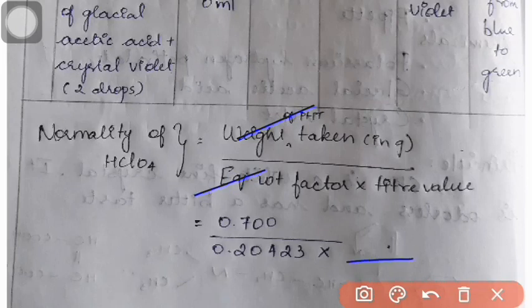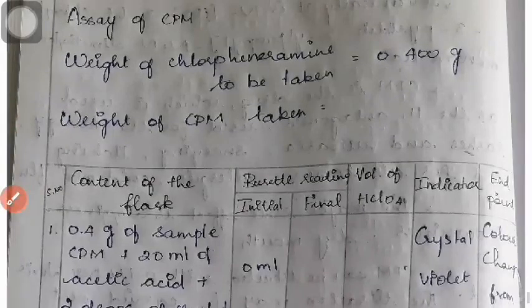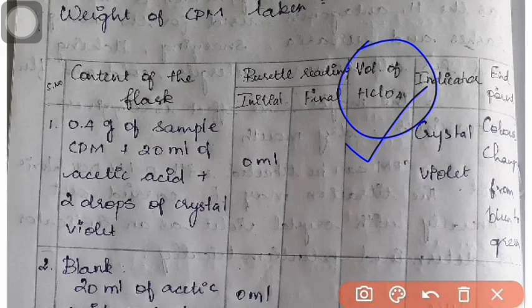That will give you the normality or molarity of the perchloric acid. And for the assay, this table is used. So 0.4 gram of sample, acetic acid, crystal violet, then we have to do the blank, blue green to green, violet to blue green, all those things are noted here, initial reading, final reading.